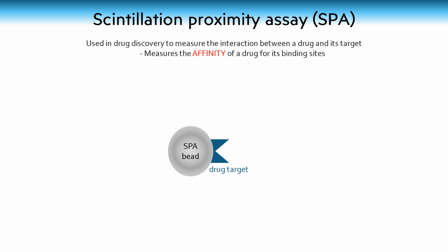The beads are made of plastic and are only a few microns in diameter. The beads also contain scintillant, which is a substance that emits light when excited by radiation. Scintillant converts the energy from radioactive decay into a detectable light signal.